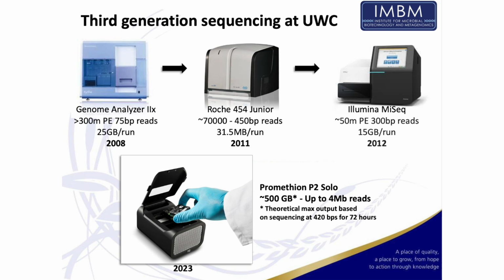So now we're approaching the sort of output that this one had with a reasonable read length. But the quality of the base calls, the quality of the sequence data that you would get, this is the gold standard today. So of course, this is their baby machine because we're interested in small things, but they obviously produce much larger machines as well.